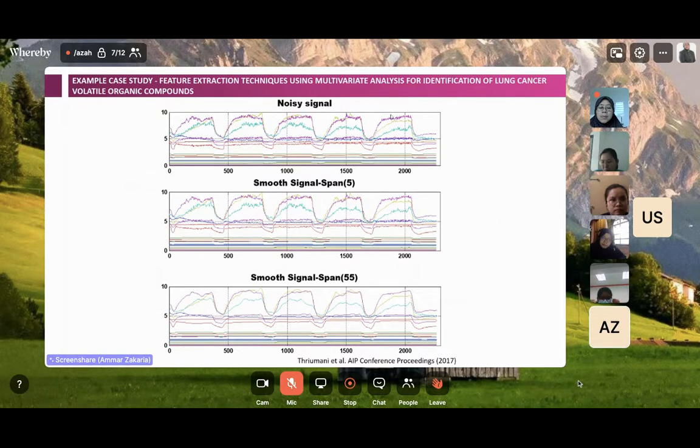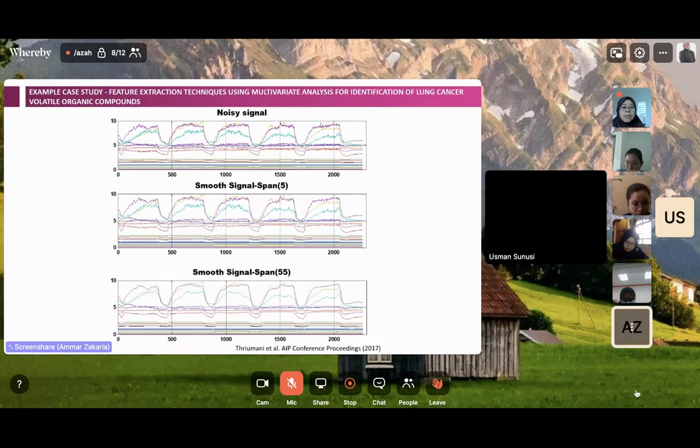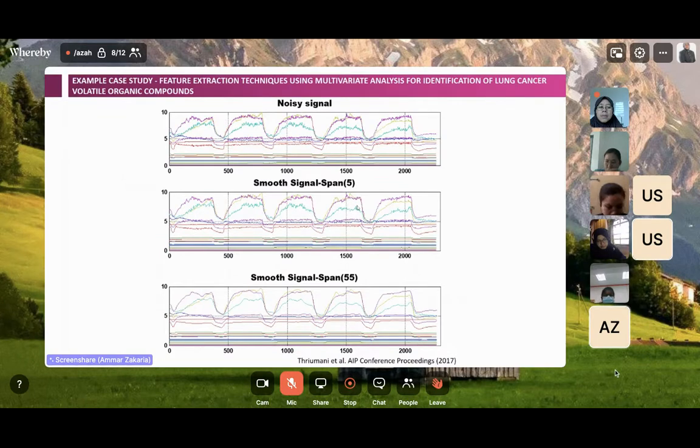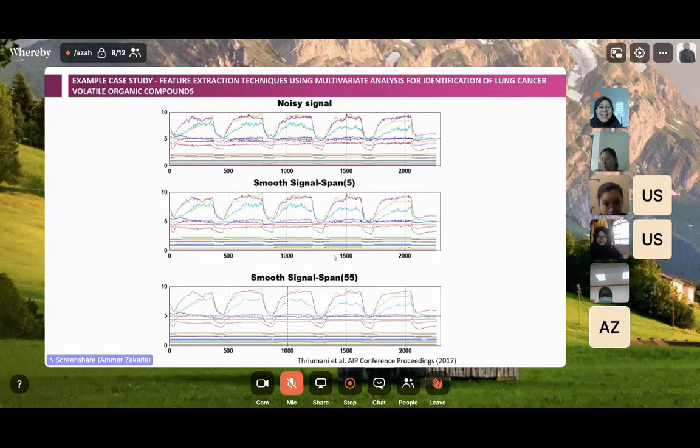That's why when we sniff the sample, we don't sniff one time or two times. Normally we sniff either 5 samples or 10 samples, so that we can determine whether the signal is consistent or not. If we sniff 5 and you get this consistent, then you can stop. You don't have to sniff longer. Okay, any questions so far? If not, I'll move on.